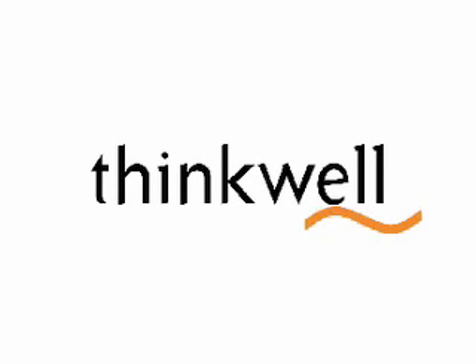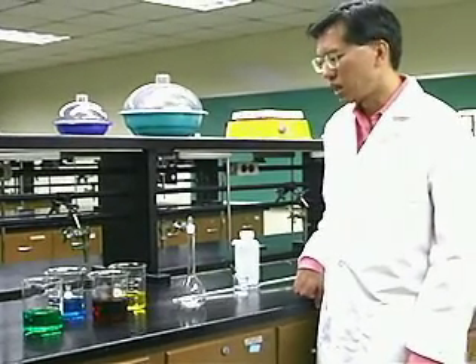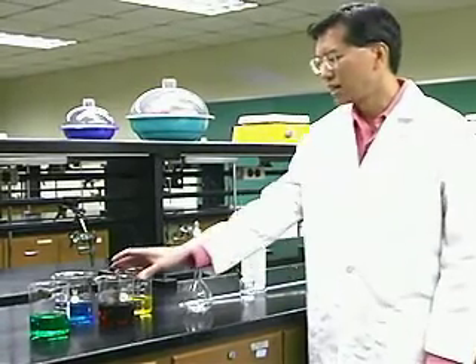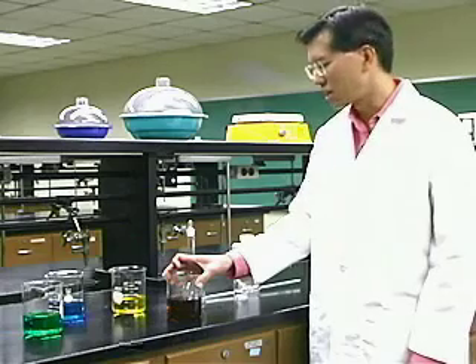What is diluting red food coloring? Suppose you do a problem in dilutions. You calculate what you have to dilute and find out that it calls for diluting 20 milliliters of red food coloring to a final volume of 250 milliliters. How would you do that?